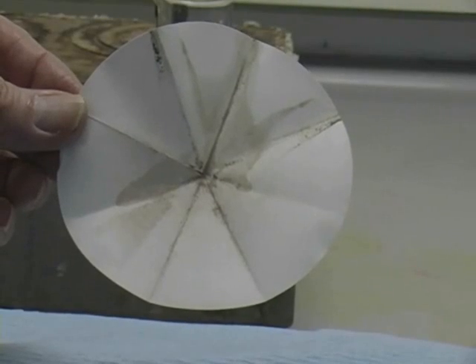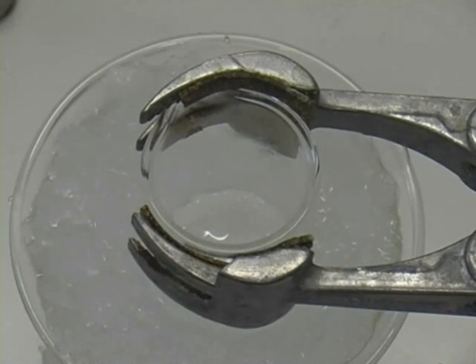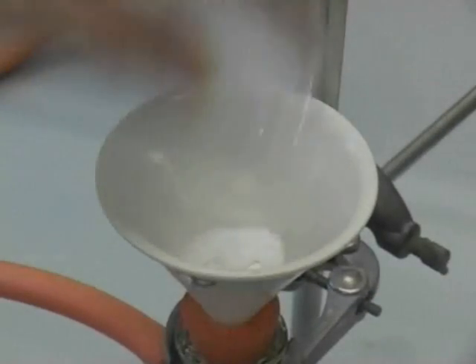This shows why you must filter. Cool in an ice-salt bath until crystals form. Filter through a Hirsch funnel and air dry the product.